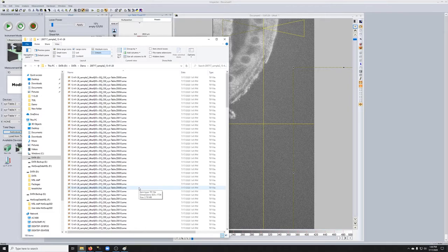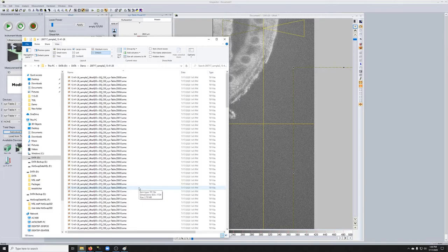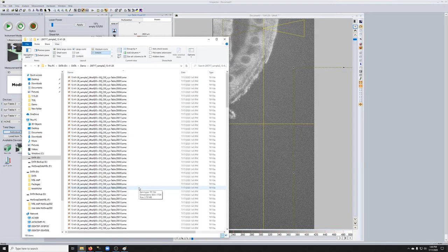Now, Imaris is not the only way to stitch. It's not even the best way to stitch, but it's the easiest. Better stitchers are unfortunately a little bit complicated to use. If you need some very precise application, let me know, and we can work on how to do that.